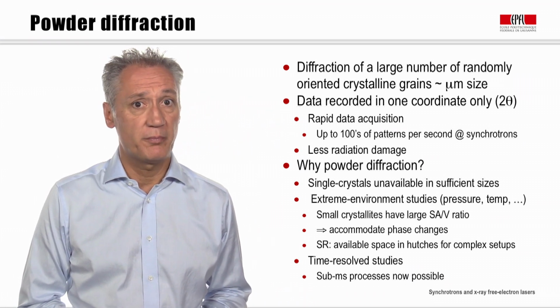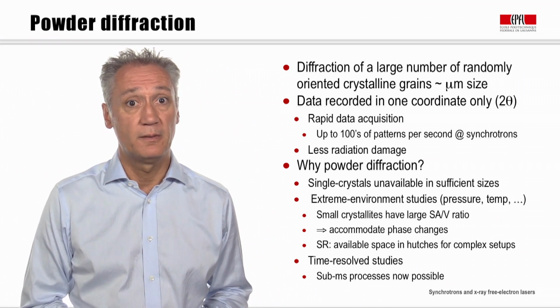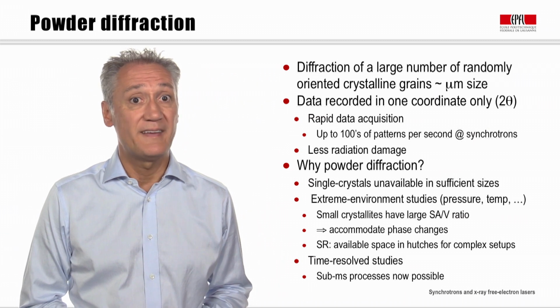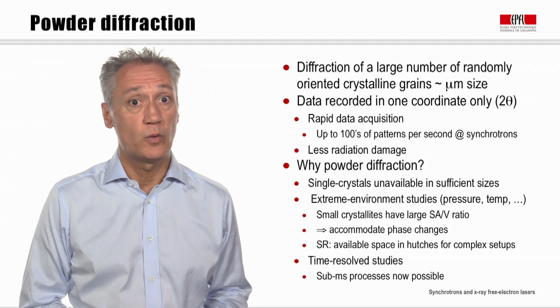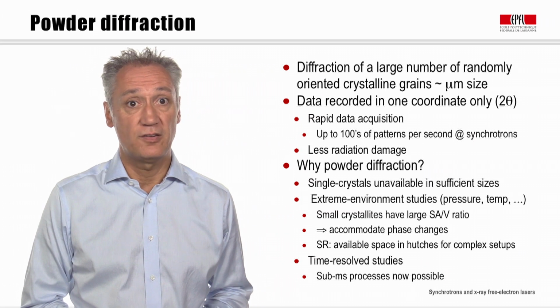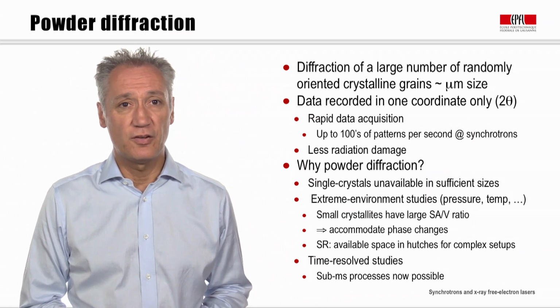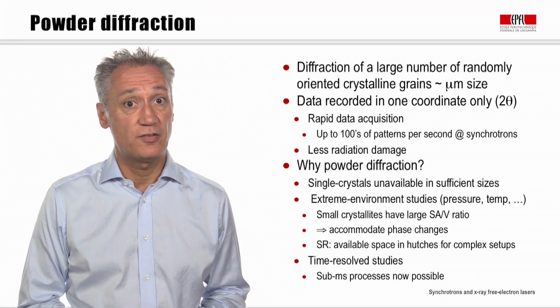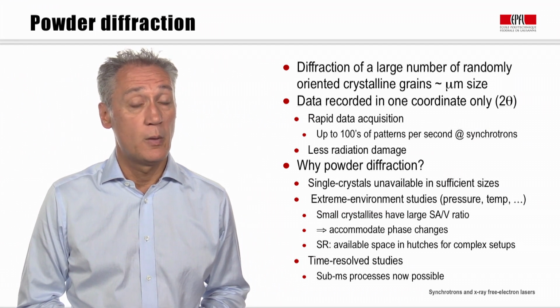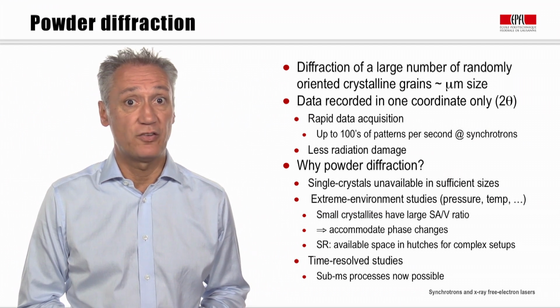Powder diffraction suffers from the fact that because the microcrystallites making up the powder sample are randomly oriented, the angularly separated information one obtains in single crystal diffraction is projected onto just a single coordinate, complicating the identification of the Miller indices of the Bragg peaks. This is called indexing, by the way. In addition, diffraction signals that are separated from each other in a single crystal pattern may overlap in the powder pattern if they are associated with the same lattice spacing.